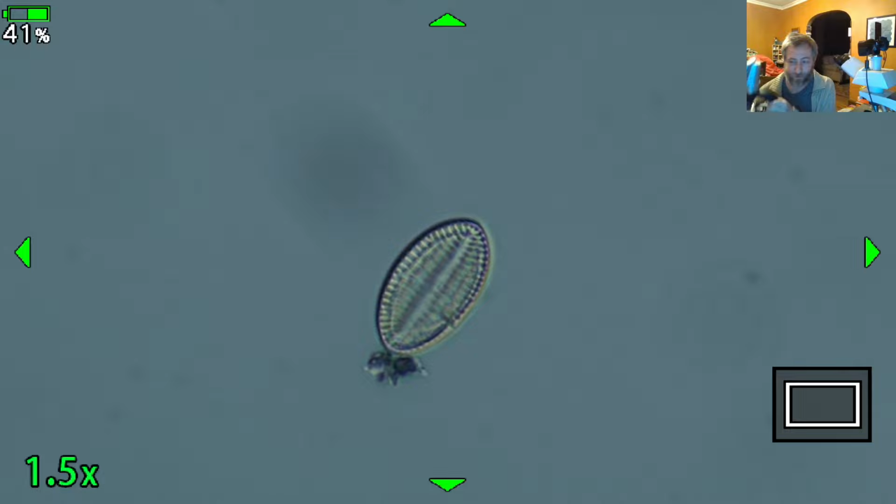These are kind of neat. It doesn't have eyepieces, it just has a camera head, and then you can just look at the camera instead of looking into eyepieces. That's good for people who don't like to use eyepieces because they get a headache from it or whatever. And then I've got slide boxes everywhere. I've got two shelves full of slide boxes basically right next to me.